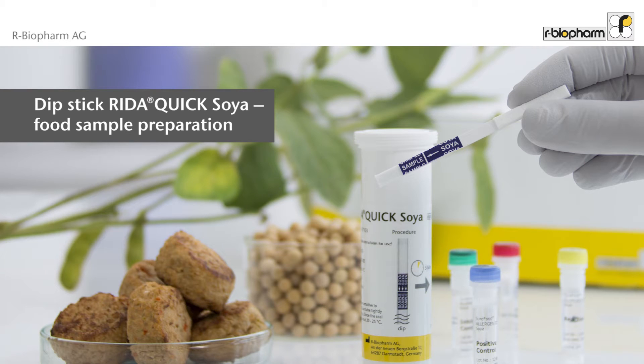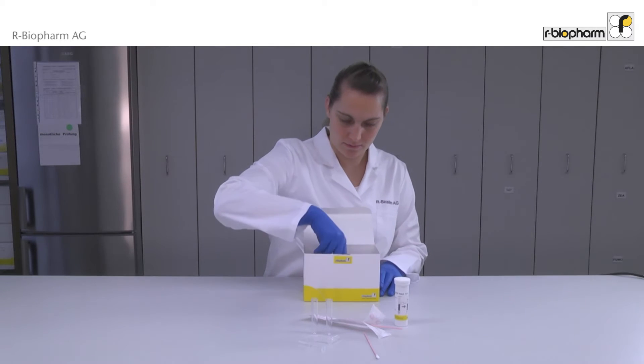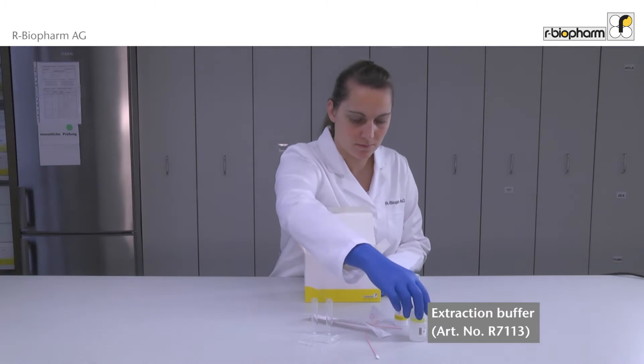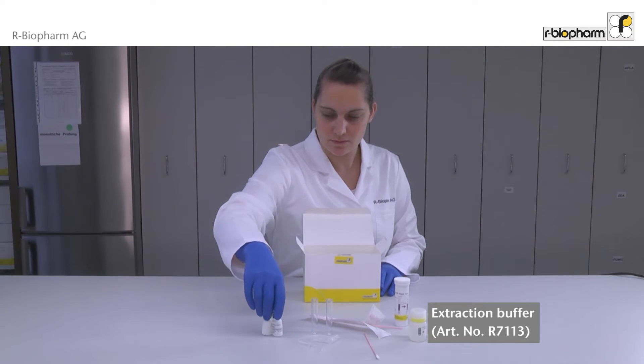This video shows how to extract food samples using the Dipstick Reader Quick Sawyer. For the analysis of food samples using the Reader Quick Sawyer, further extraction buffer is needed. The extraction buffer contained in the kit is only sufficient for two samples.